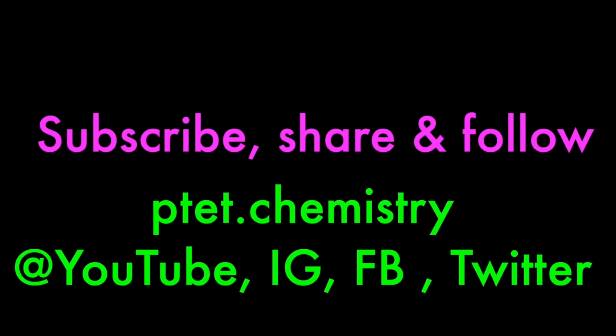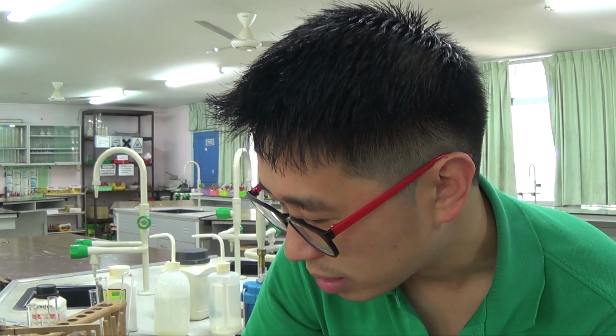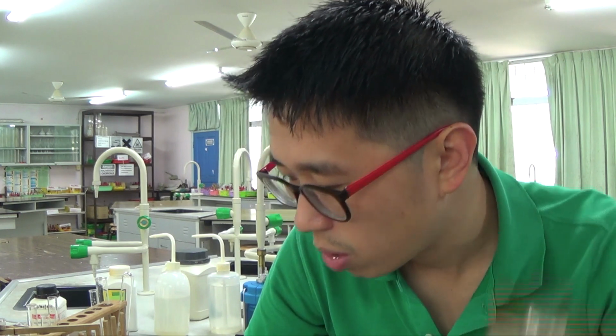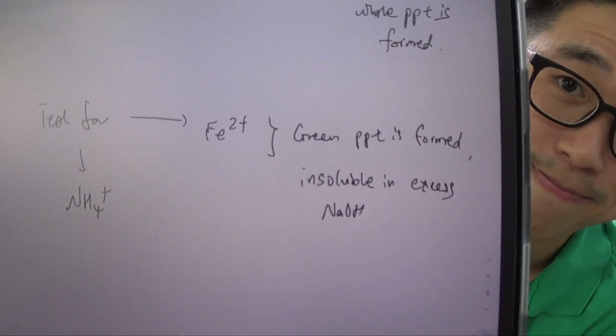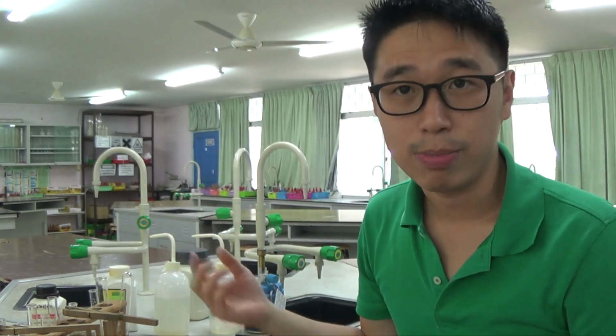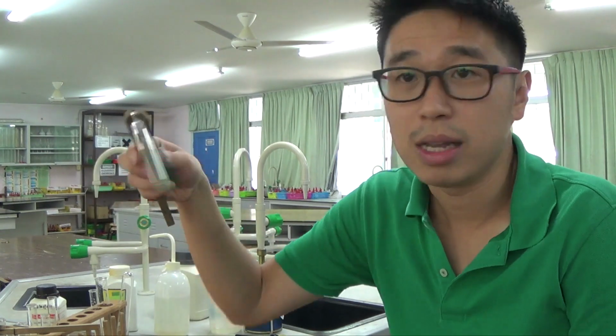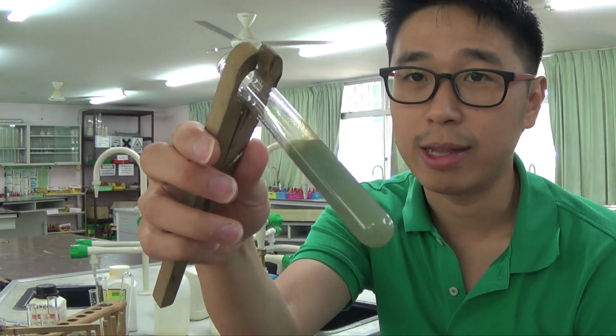That's why you cannot see through it, because this is a precipitate that remains insoluble and does not dissolve in excess NaOH. Green precipitate is formed, insoluble in excess NaOH. Okay, so that is what you see. This is what you write. Remember that in the test for cations, colored species mean it's a transition metal. Green color, like my shirt, could mean that it's chromium 3+ or iron 2+. Therefore, you have to add in excess.